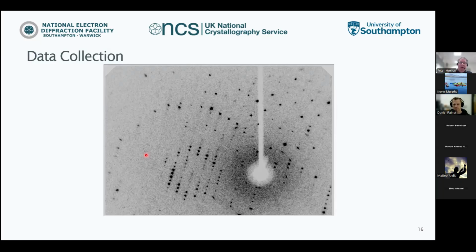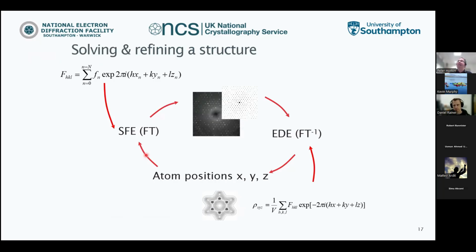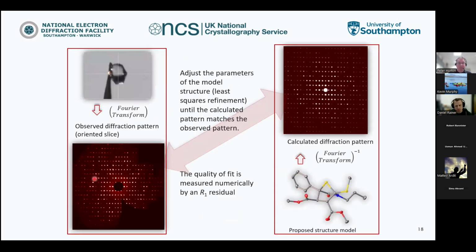But we hopefully get all our images, and this is the final horrible maths slide I'm going to produce. We have a whole load of equations: a straight Fourier transform and a reverse Fourier transform, and equations of how all these atoms are summated to get the crystal structure. This looks horrible. There's complex numbers and other things. I'll do it in a different way.